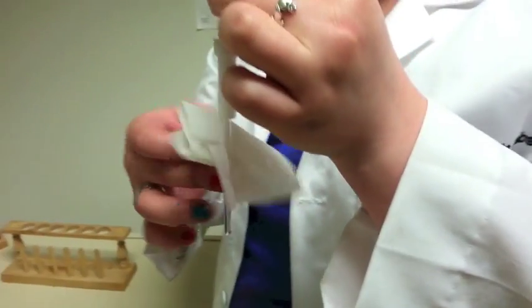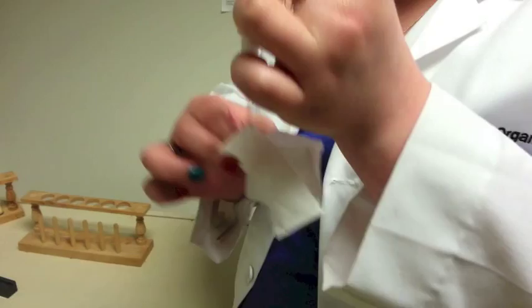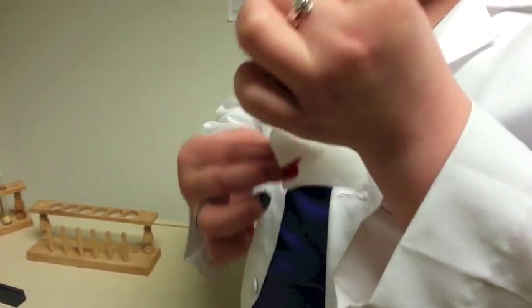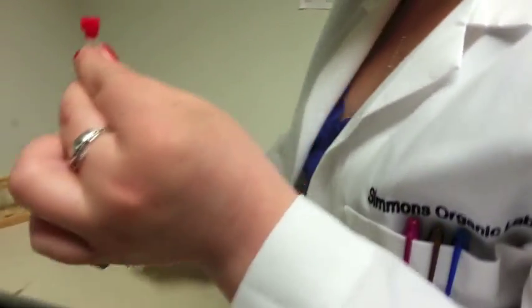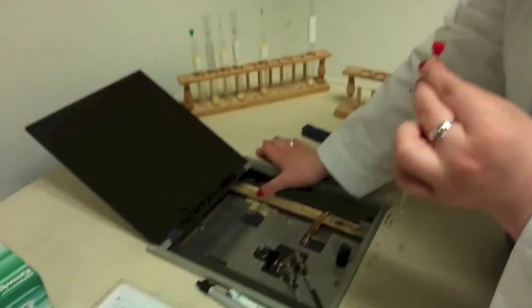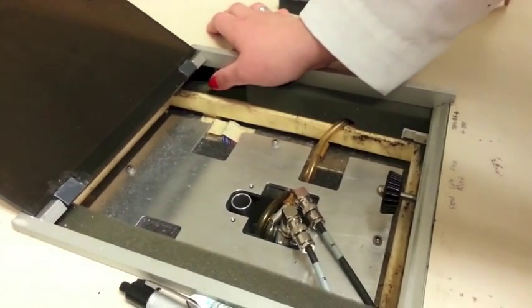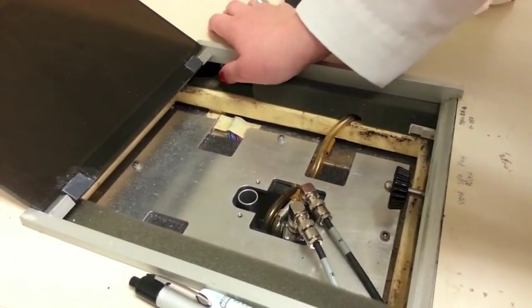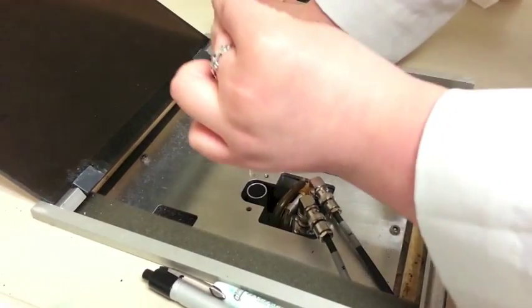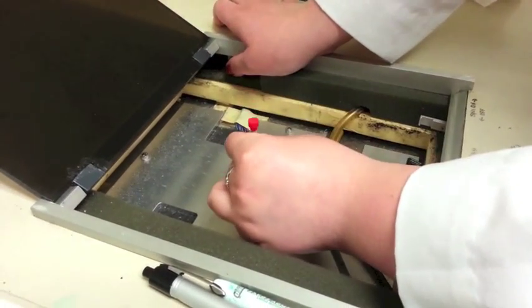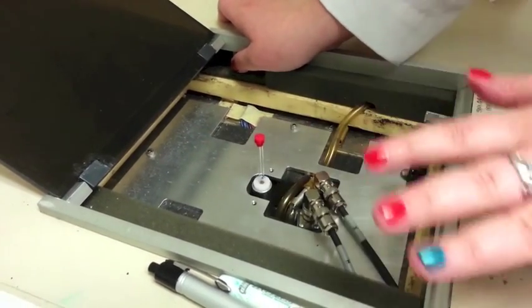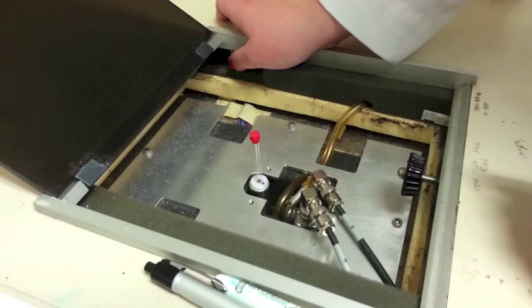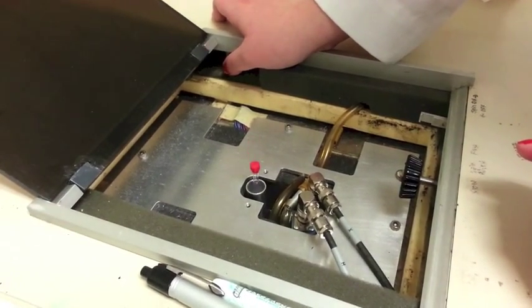Last thing you want to do is wipe it all down really good before you put it in the machine to make sure there's no fingerprints interfering with your scan. Then you want to go ahead and press the button again. You should hear a whooshing sound. You can go ahead and insert your sample, and then slowly release it.